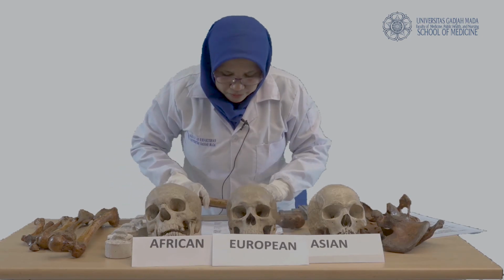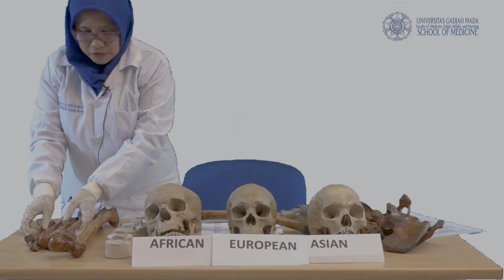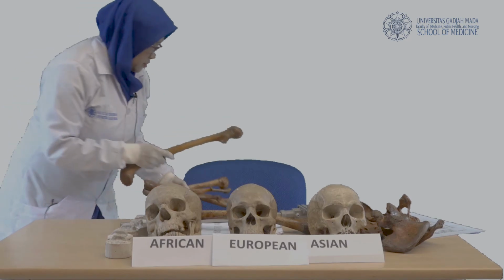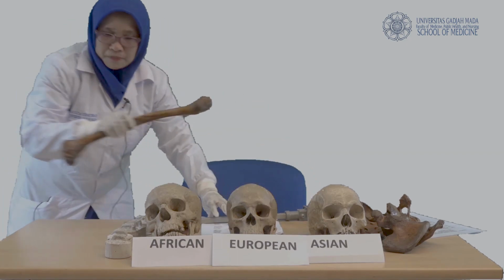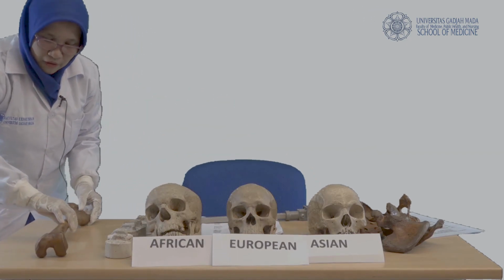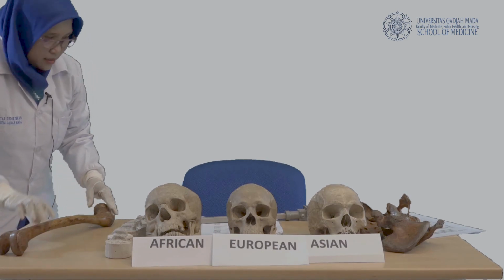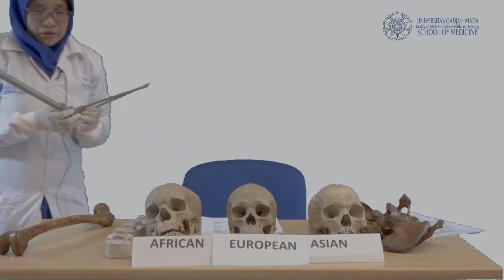How to take the measurement is like this. First, put the long bone on a hard and smooth surface. Then use a long sliding caliper.